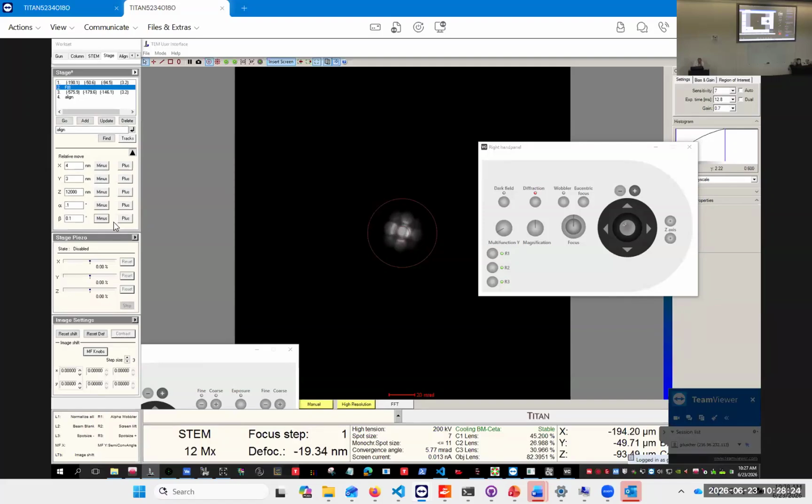That is the wrong direction. Does everybody see that? So the white line goes over there. So we want to go positive. Oh, that was perfect already. I'm glad I messed it up. So this is a bit closer.